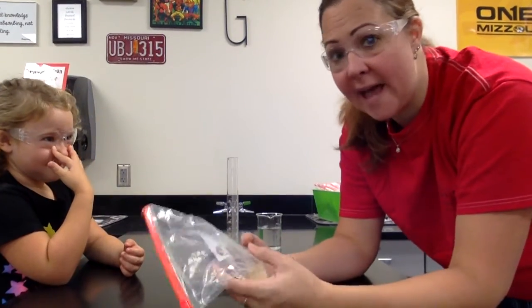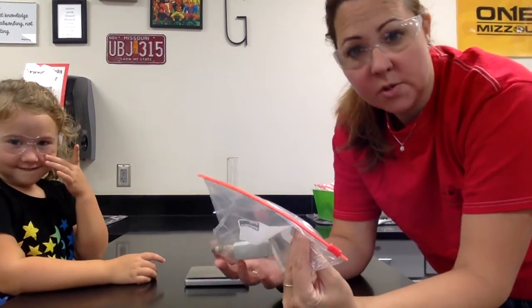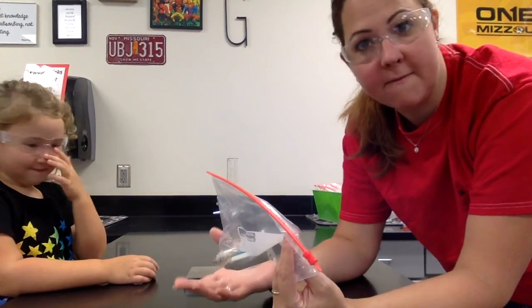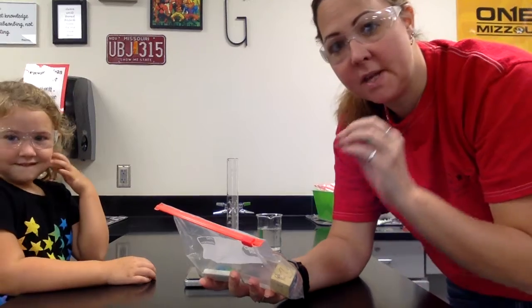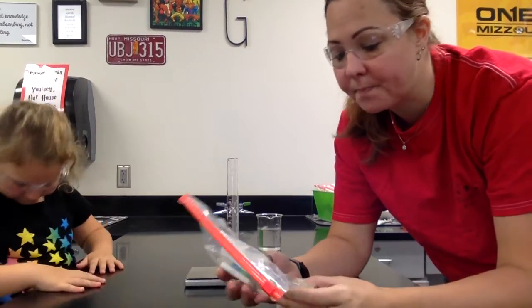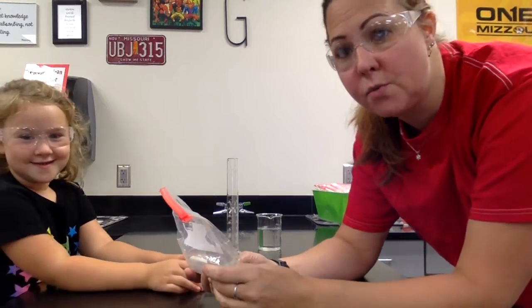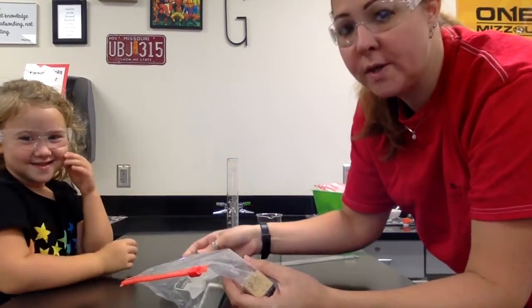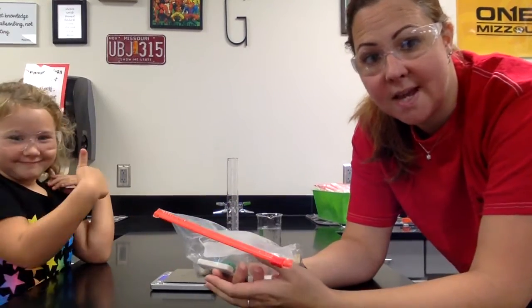Today we have a lab, and the lab today is over density. In the notes we learned density is how much stuff, mass, is in a given amount of volume. So we're going to take mass divided by volume to get our density values. We also learned that there's two different units that we use to measure density, and that's because we have two different units on how we measure our volume. And I'm going to show you both of those methods today.